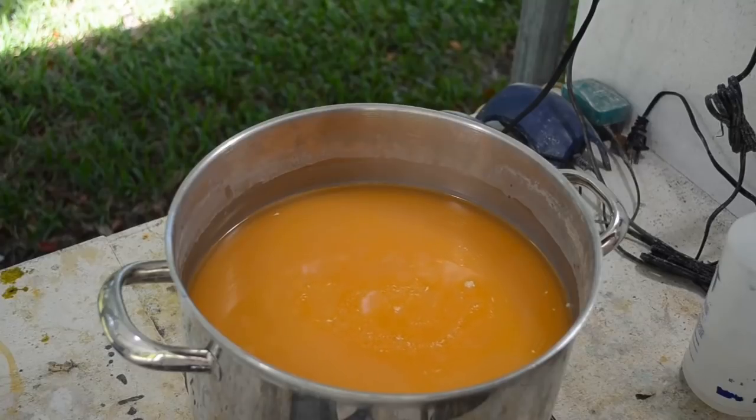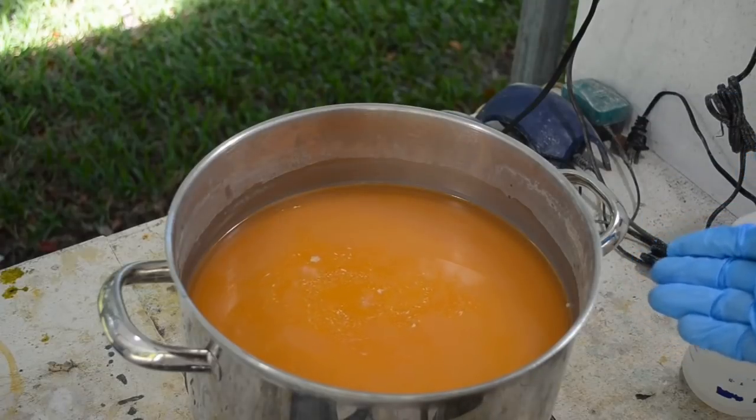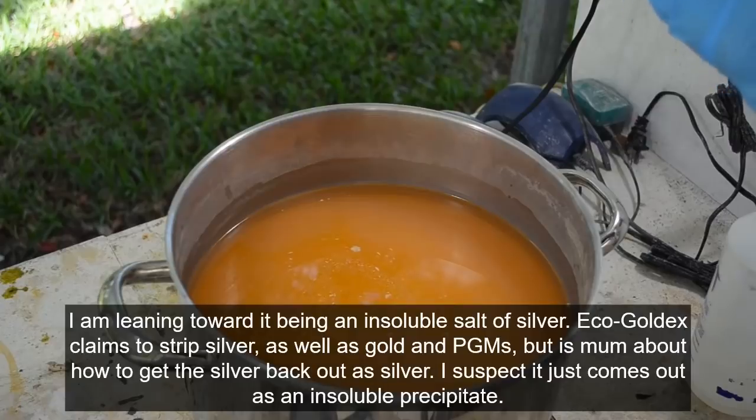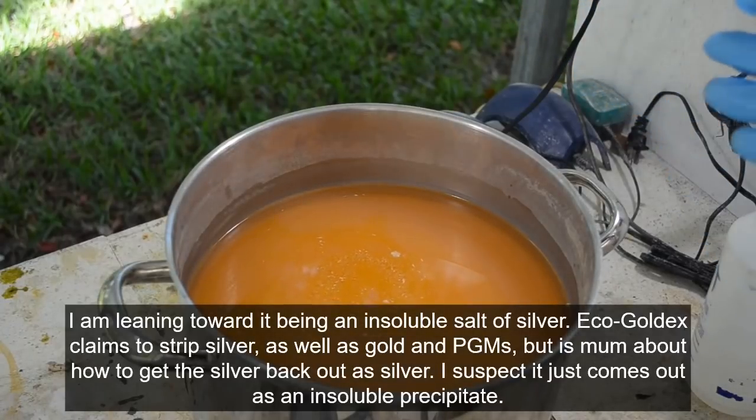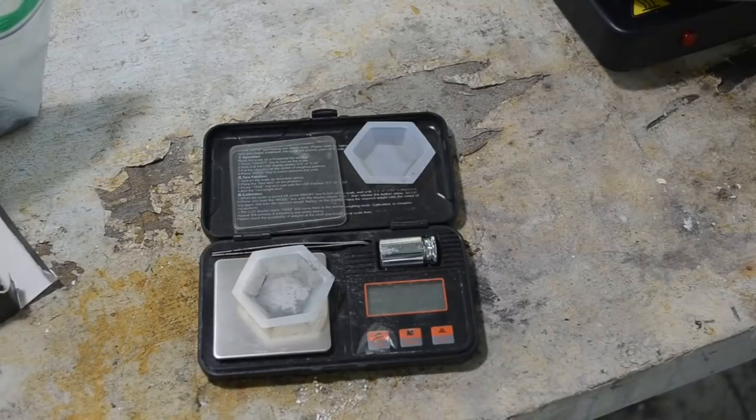And like I say, this precipitate issue has been dogging me from day one. I suspect it's some sort of insoluble metallic salt that's formed once the pH is adjusted. Now, it happens to me whether I'm using the hydrochloric or muriatic acid. It happens to me whether I am using the sulfuric acid. So, I don't know. It could be a tin salt. It could be silver. It could be silver sulfate, I suppose. Maybe it's silver chloride when I use hydrogen chloride. I don't know. It's weird. But we've got the pH where it needs to be. Okay, time to add some zinc.